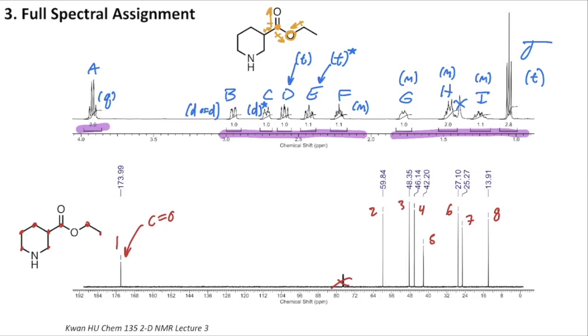The last one here is this nitrogen. Again, nitrogen isn't the most electronegative. It's less than oxygen, but it's still more electronegative than carbon. So we have to keep in mind that we're going to be pulling some dipoles in that direction as well. Then if we think about the places we haven't drawn in dipoles, we can assume that those are going to be much more similar to regular old aliphatic sp3 hybridized CH bonds that don't have a lot of other interesting functional groups around them. So with all of that, we just want to keep these three chemical shift ranges in mind, and then we'll come back to them when we have a little bit more data from our HSQC and our COSY.